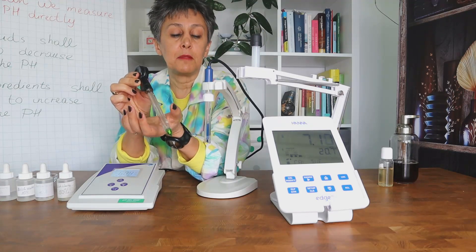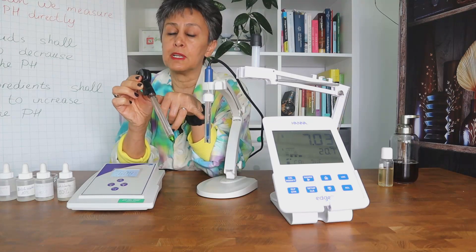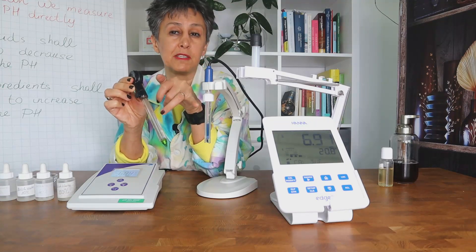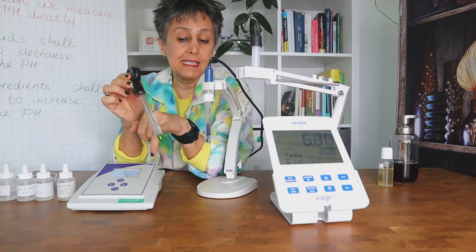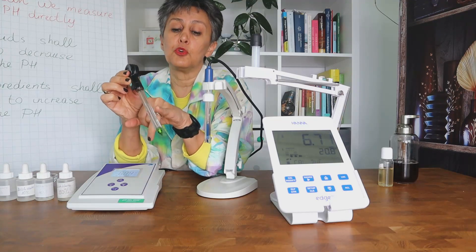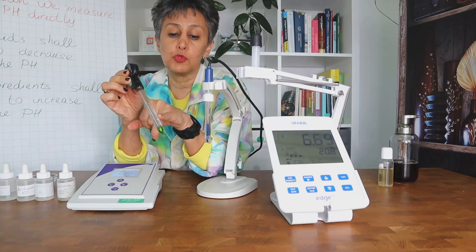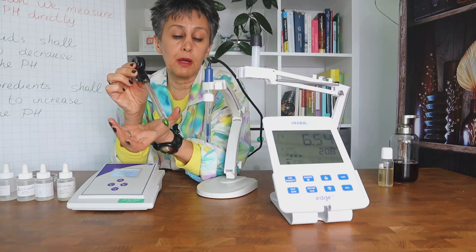The supplier recommends that we can measure the pH of creams directly with this specialty electrode. However, for a high-viscosity product such as a shower gel, even with this electrode you still need to take a sample, because you don't want to dip the electrode directly into the bulk of your product.